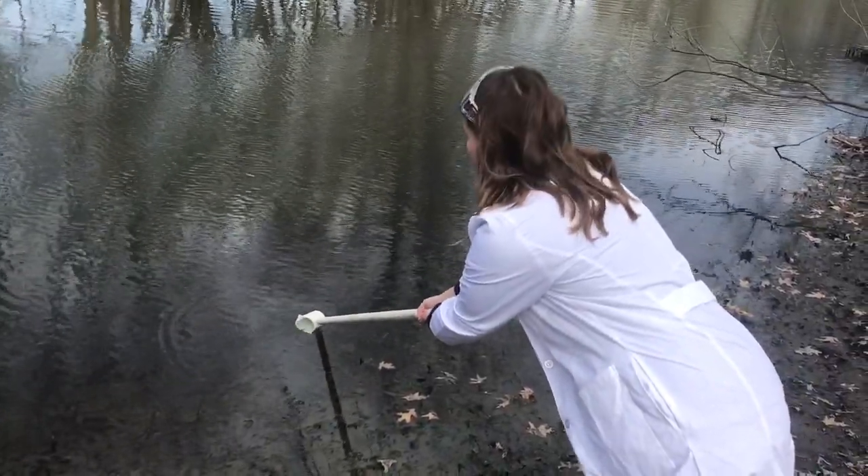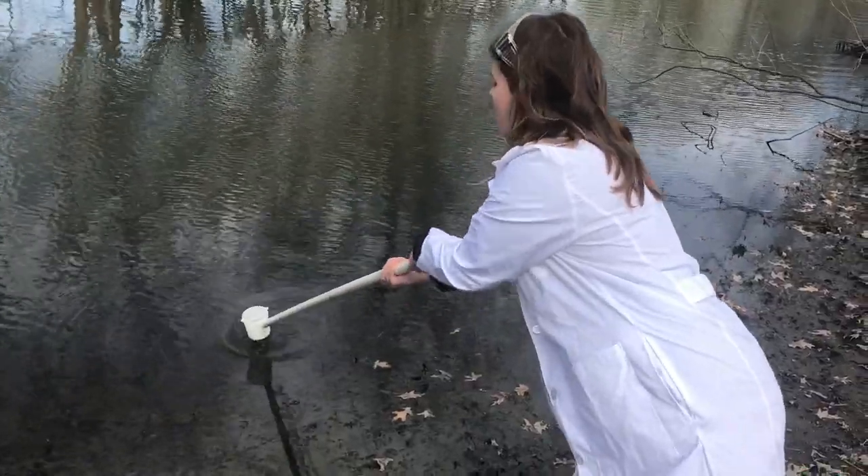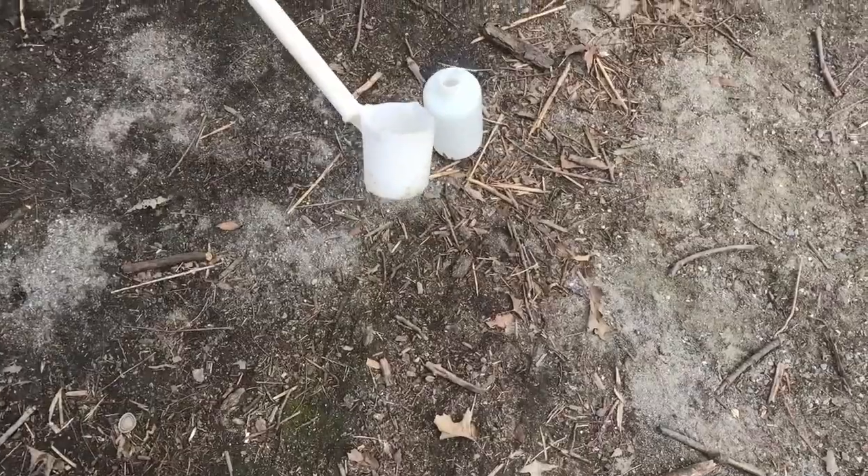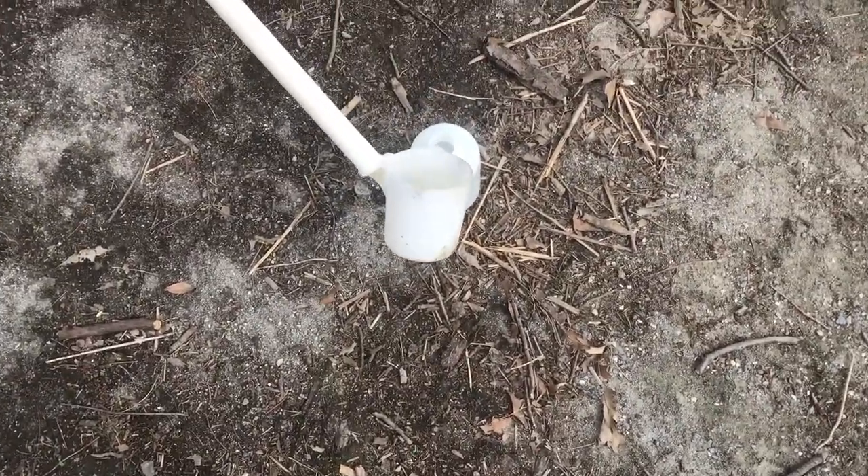Just let it filter in, and then scoop the water out of the river and pour it in. Once you're done, you're going to pass it off to your colleagues. Hopefully it's nice weather. Let's truck back — let's go, gang.